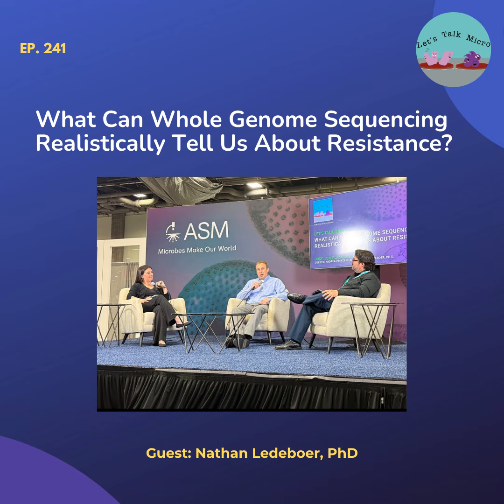So we've seen for the very first time this year, Epic, for example, has actually developed a genomic data repository that's a part of the electronic medical record, meaning you can take either FASTA files or you can take more semi-analyzed data, upload it into the electronic medical record so it can be analyzed by just about anybody. You can imagine, not only from detecting resistance, but also from the perspective of epidemiology, how powerful that can be.